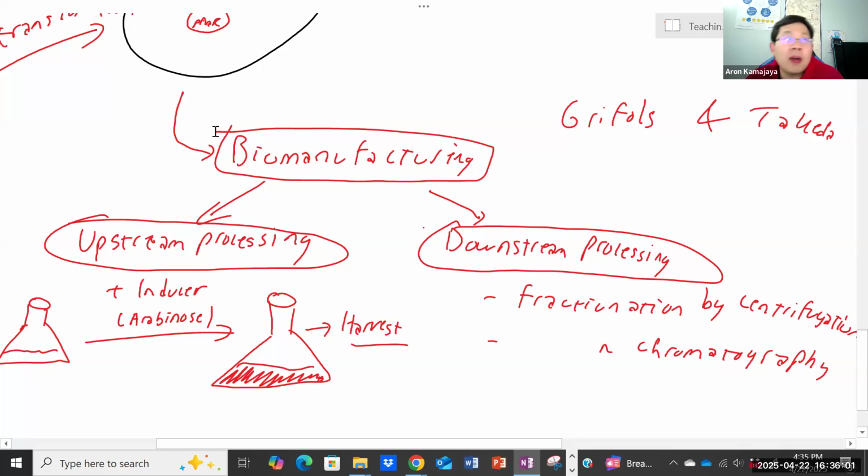We will monitor the optical density, but if you're actually in a company, yes, optical density information is important, but equally important is how happy your cells are. Well, the question is, how do you know that? You can't just ask them with a microphone, hey, are you happy? You can't do that, right?